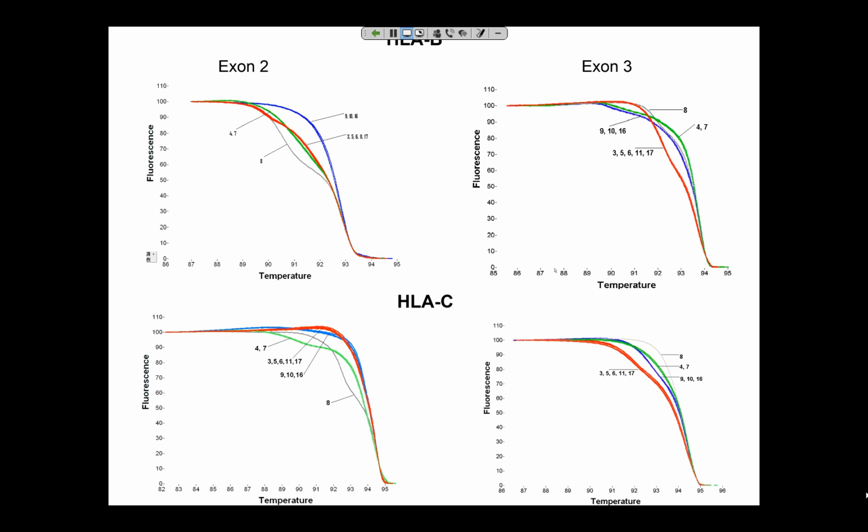because there's only 4 possible genotypes or combinations from the 2 parents. Crossing over is rare in HLA. So what does this mean? Well, it means that you are transplant compatible with everyone in your particular cluster. So if you're in a cluster with a lot of siblings, that means there's quite a few choices. There is one case here, sibling number 8, that had no particular match. So a method of very rapidly, without genotyping, determining sequence compatibility just by melting curve identity.